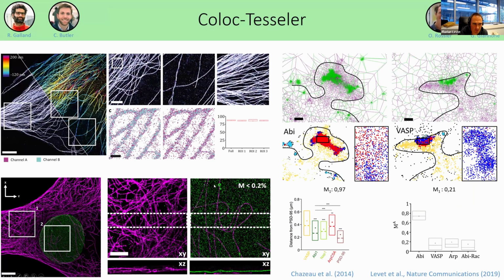And so what we have shown is that it's very robust to the localization density. To do that, we used a control that was very simple, let's say. We did a DNA-PAINT acquisition of microtubules that was 10 million localizations. We split this dataset in two, meaning that now we have exactly the same structure labeled in these two datasets.